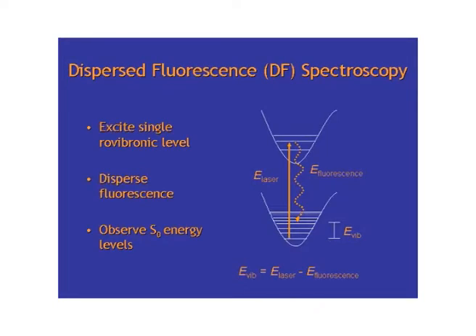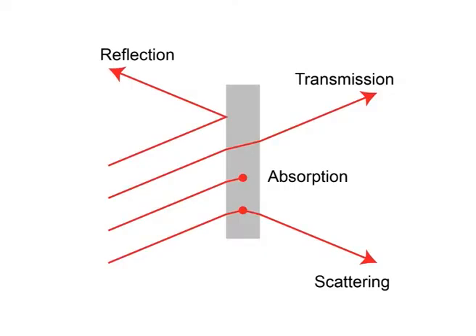It is also possible that the object may exhibit photoluminescence. This is the secondary radiation. This radiation possesses lower energy and longer wavelength as compared to the light of the exciting source. Fluorescence may be considered as interaction between light and material. Fluorescence is an emission of light of certain wavelength. The resultant emission spectra are highly characteristic and provide quantitative and qualitative information about the compound.